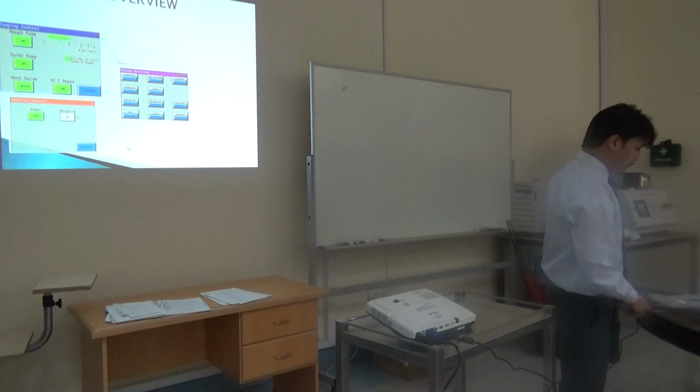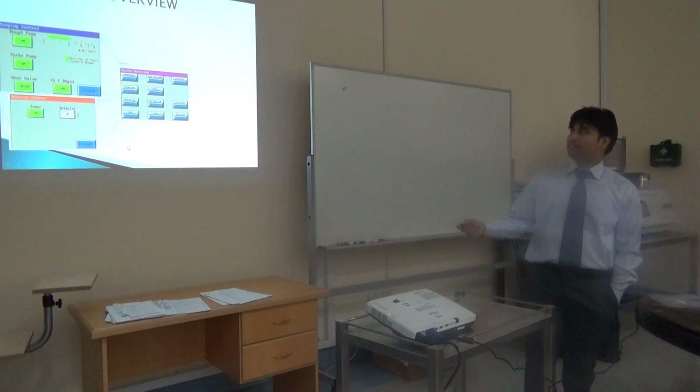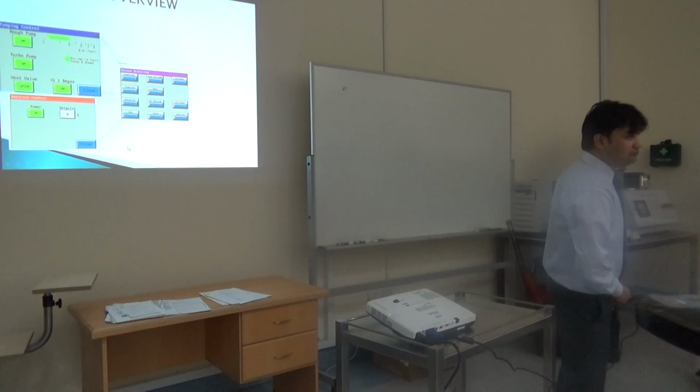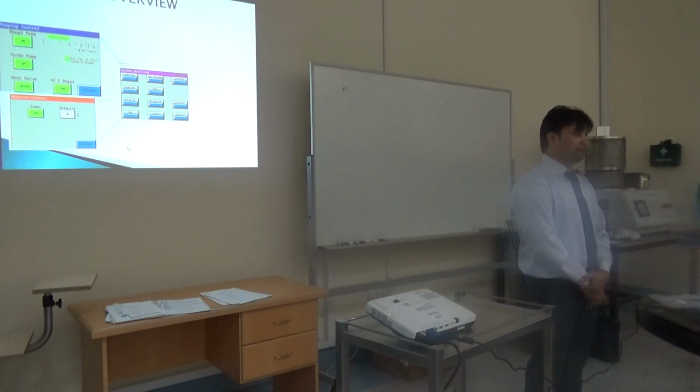Next, if you touch this rotations display, then this becomes the power and set point. The second, the set point, is a percentage. You said from 0 to 20 RPM. So percentage of the 20? Percentage of the power percentage. Generally we go for 50%. 50% power will rotate at 10 RPM. Yeah, the power percentage.